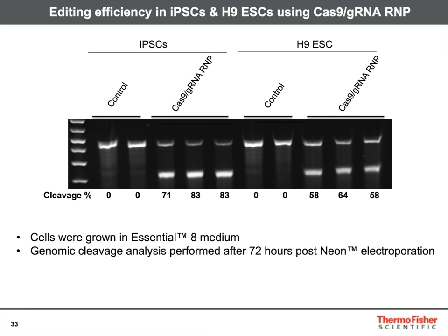So far, I have talked about delivery of CRISPR-Cas9 using Neon electroporation in iPSCs. Next, I will talk about delivery of CRISPR-Cas9 in iPSC using newly developed transfection reagent, Lipofectamine CRISPRMAX.